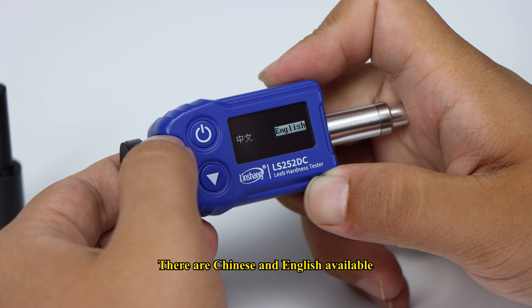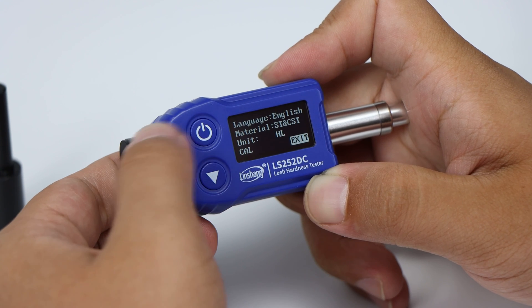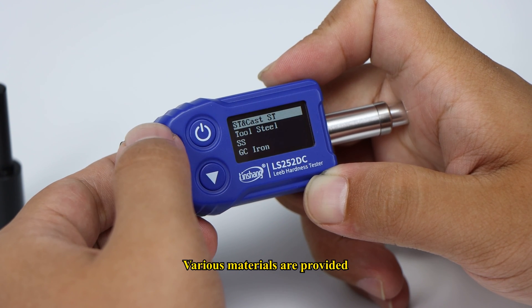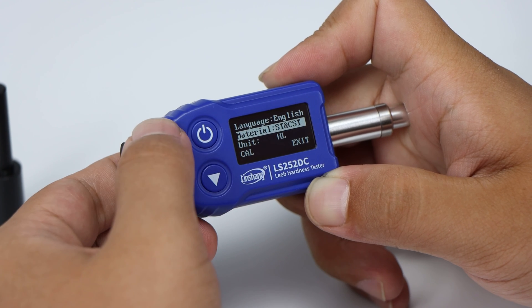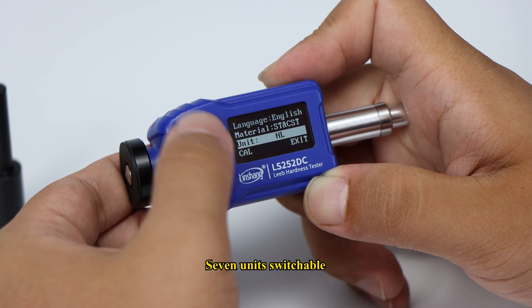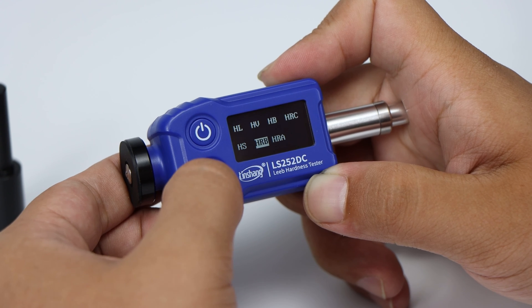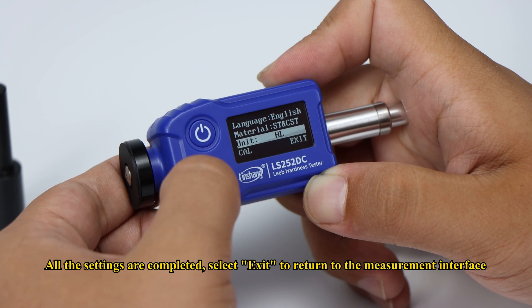There are Chinese and English language options available. Various materials are provided. 7 units are switchable. All the settings are completed.